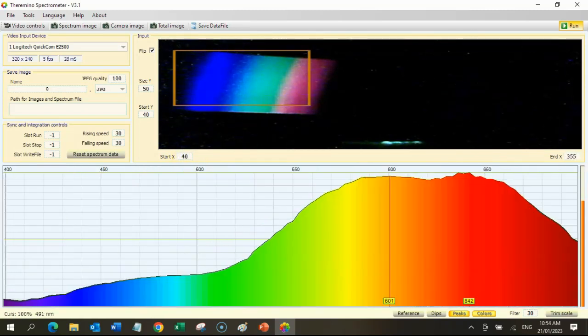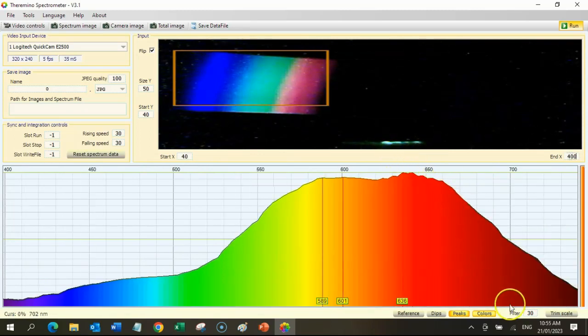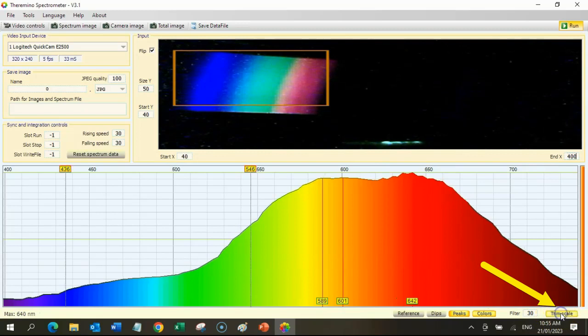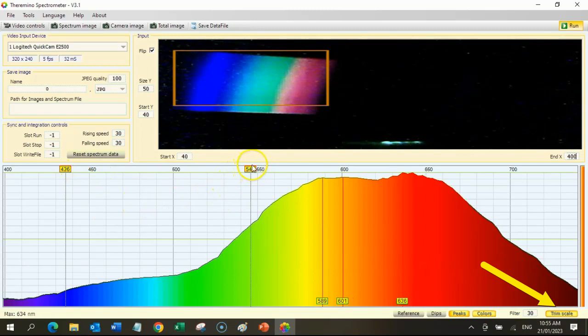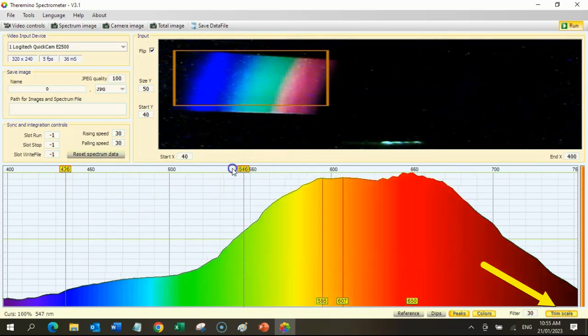The next task is to calibrate the line spectrum in the lower window. Begin the calibration by clicking the Trim Scale button that's on the bottom right of the screen.